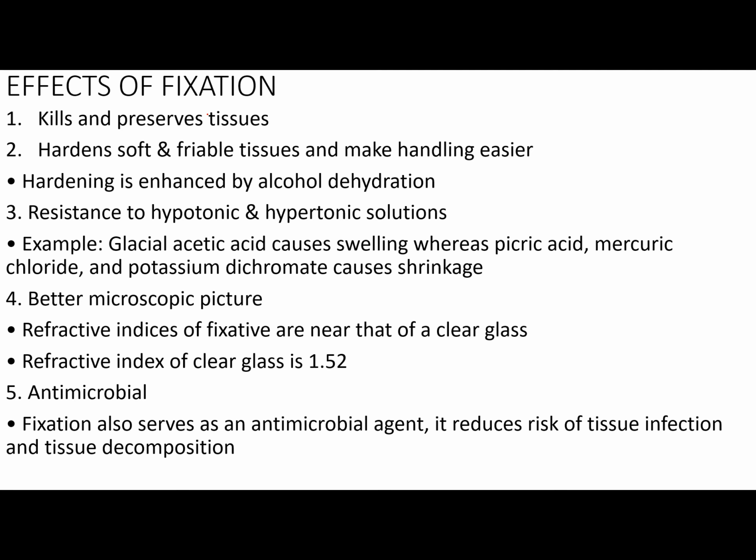Then resistance to hypotonic and hypertonic solution. An example of this is that glacial acetic acid would cause swelling, whereas picric acid, mercury chloride, and potassium dichromate cause shrinkage. So, yung tissue nyo, class, by doing fixation, nape-prevent yung pagka-swell at pagka-shrink.